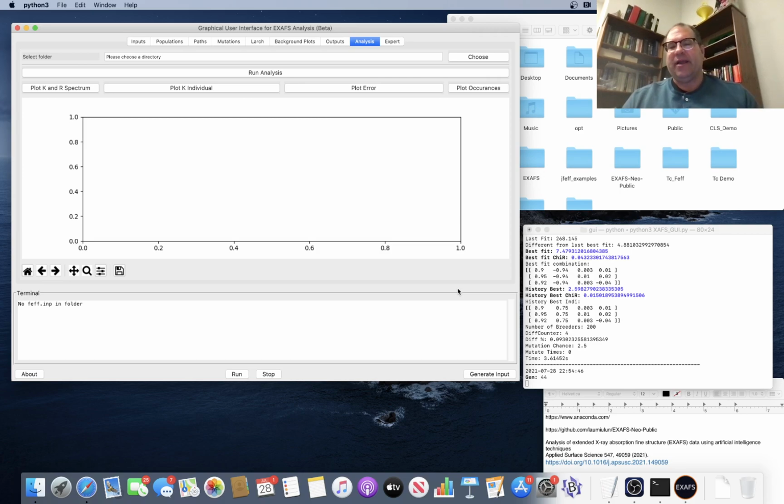Okay, I brought us back because we're now approaching the halfway point in the total number of generations. We're on generation 46 right now. It has just completed 45. And when it gets to the halfway point, after it completes generation 50, it goes ahead and tries to optimize E0.